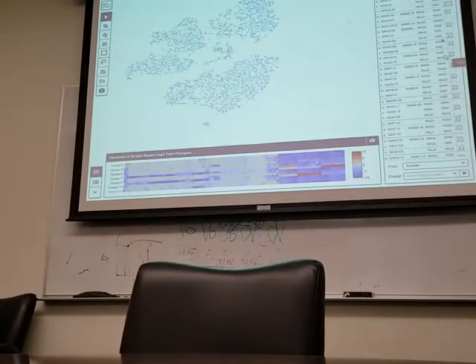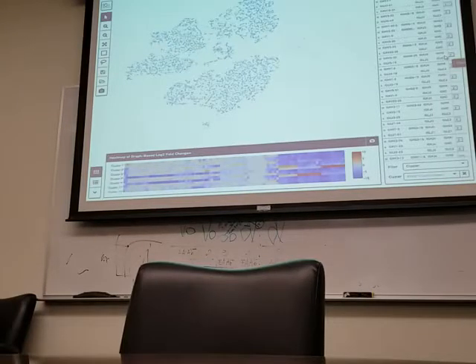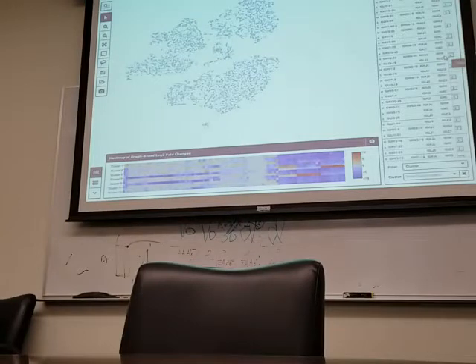Right. Based on this other data I was just describing, it was also sorted into T-bet high and negative, or FCRL5 positive and negative memory too. And that was 7 and 14 days after vaccine, and so they were very expanded. Oh yeah. So there's no intervention in this. No. So you don't even know what drug they're on, do you? Right, that's right. But similarly, immunosuppressant, we did notice a big difference between 165 and the other two.